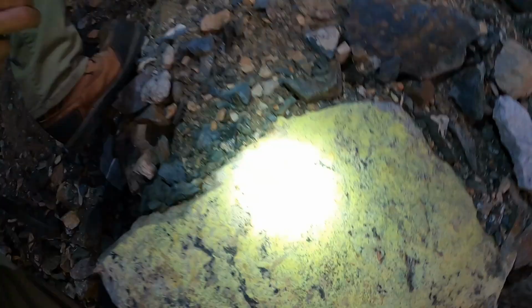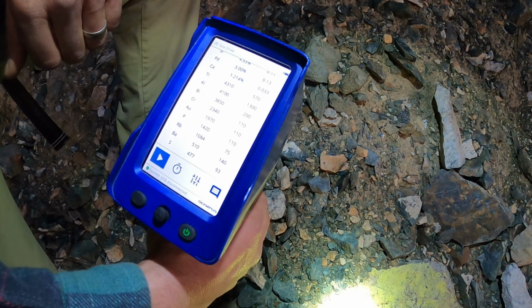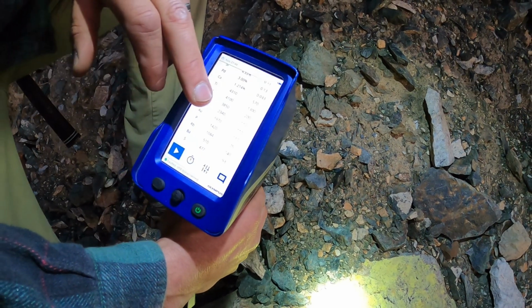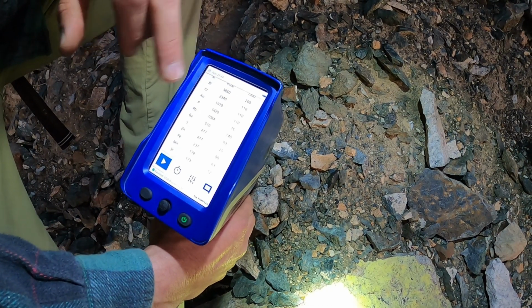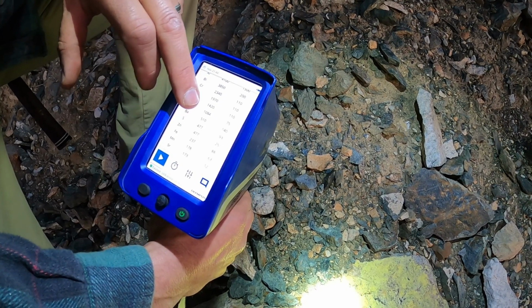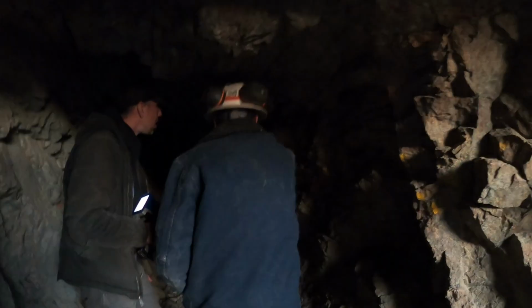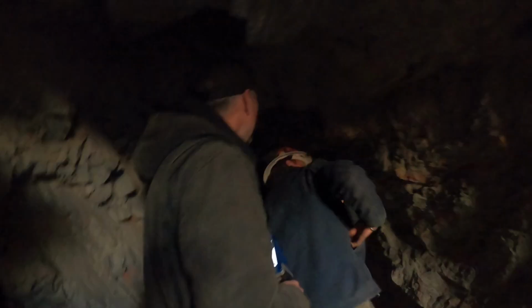We got a staggering 18% uranium assay at this location. The uranium was so high at this location it actually affected the XRF and showed high gold and palladium values that aren't really there. If you crush this rock down and mixed it, it would probably come in far less than that though. Somehow I accidentally had time lapse on when I was shooting this portion of the video, so I missed out on some good audio.